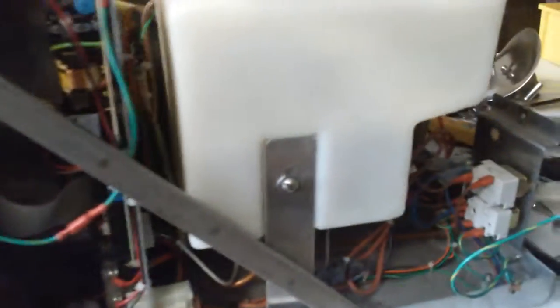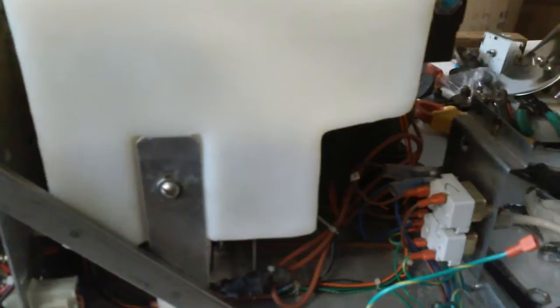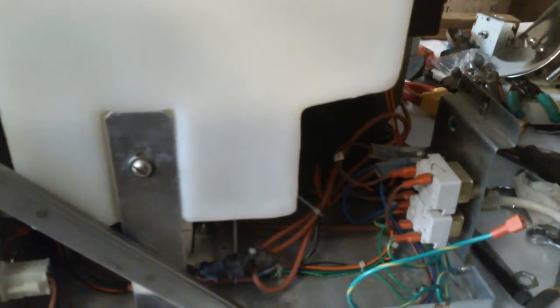On the rear side, you'll see the power connector and two protection thermostats. The top one has a reset button, and the bottom one has no reset.